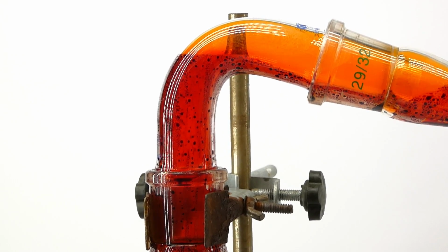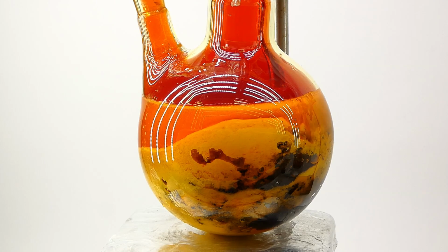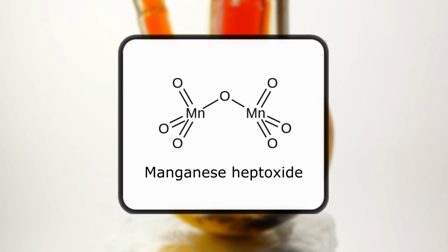That's why I have to make my bromine in a different way than everyone. I also have to make a pretty substantial quantity of it, so finding a good method was really difficult. After some research, I came across a route that should produce a lot of pure bromine, but it has the slight drawback of using an extremely explosive and incredibly dangerous compound, which is manganese heptoxide.